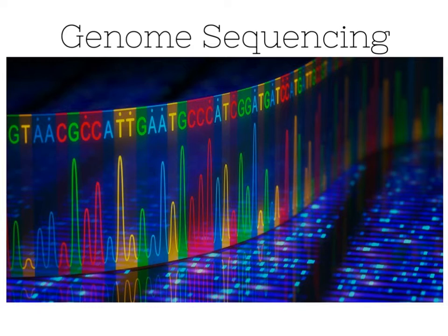And in order to discuss genomics, the first thing we need to look at is genome sequencing, determining the exact sequence of DNA that is present within an organism. And so, as we look at this schematic, you may be wondering what in the world we are looking at here. What we are looking at here is what we could think of as a chromatogram of the different nucleotides that make up DNA.